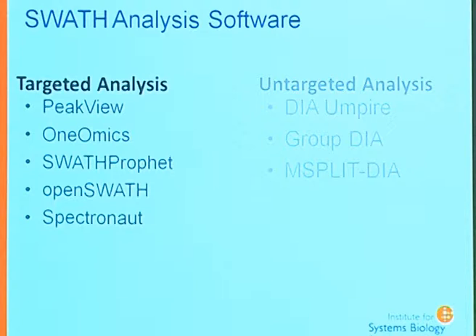As long as you do that with just individual peptides or proteins that you know you're interested in, you know what you should look for and so on, that's fine. As soon as you want to have a broad picture, what you end up with is essentially a table with all this information, and you would have to walk through that. It's like a shotgun analysis with a long list, and you have to make sense out of that. So there it gets a bit complicated.